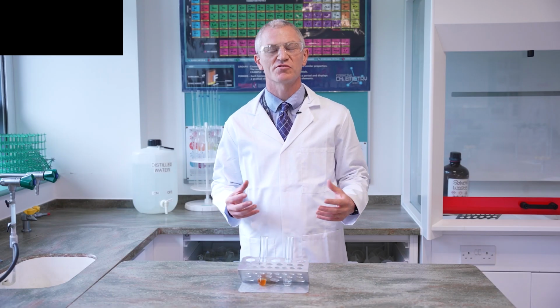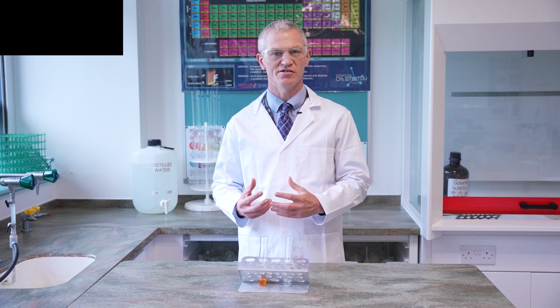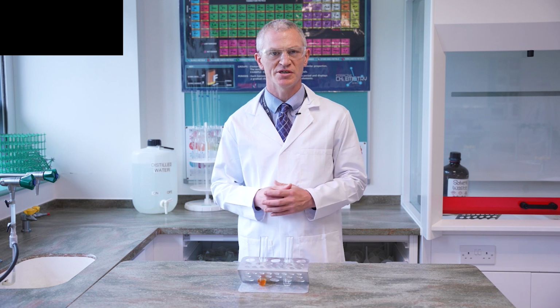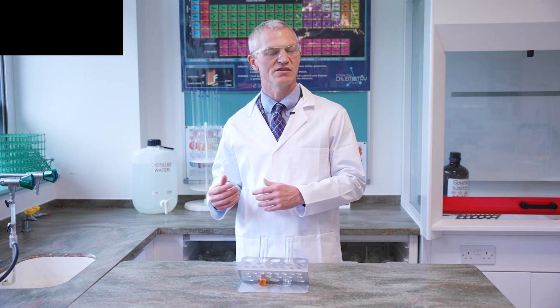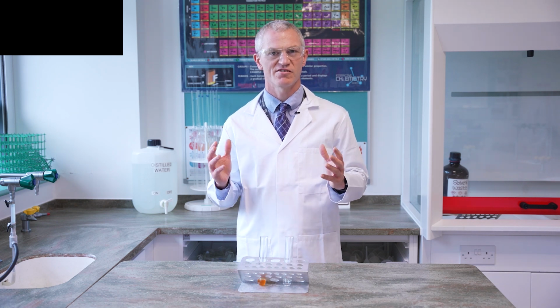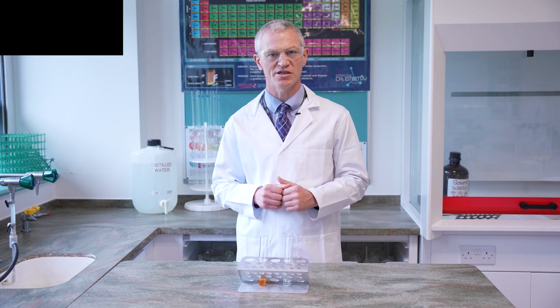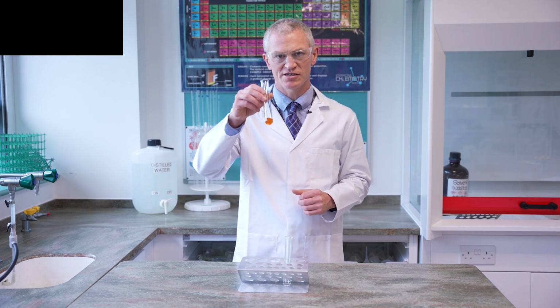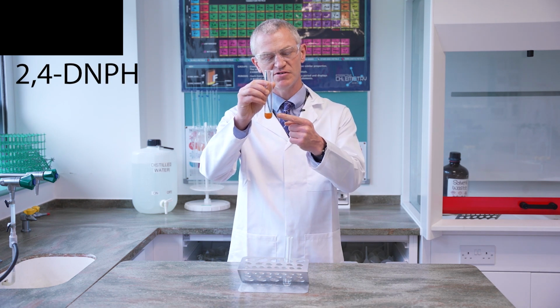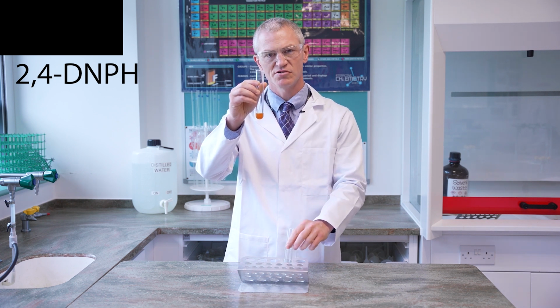In this video, we're going to talk through the reaction of a compound containing a carbonyl group with 2,4-DNPH. 2,4-DNPH also stands for 2,4-dinitrophenylhydrazine. And do not worry, you do not need to remember that name. You just need to remember 2,4-DNP or 2,4-DNPH. Now, 2,4-DNPH is in this boiling tube here. So you can see it's a very orange colour, unmistakable. Okay, and we're going to add it to a ketone.